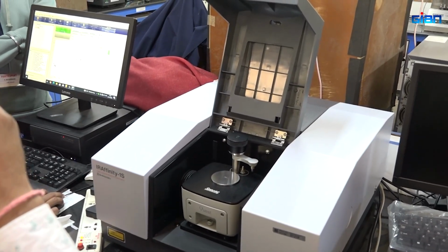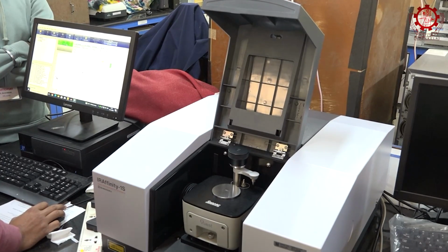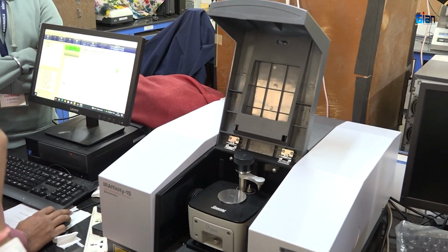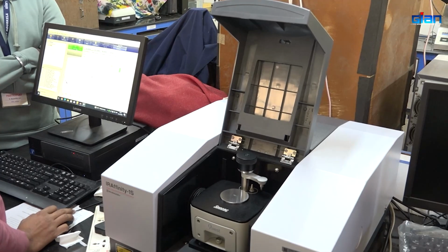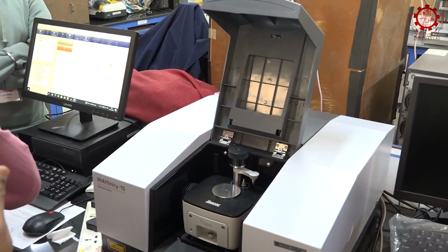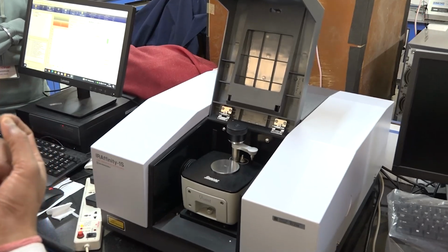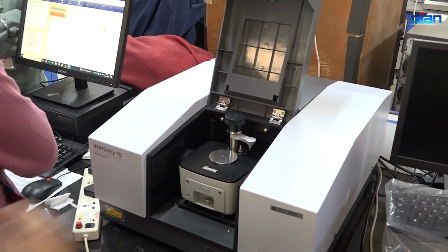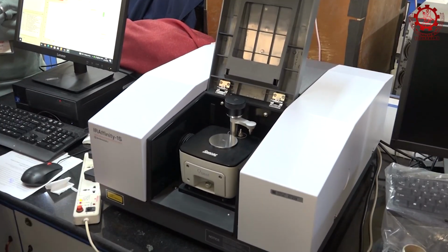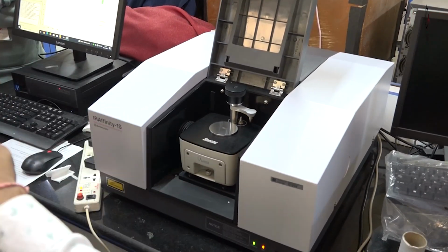Now when the solvent is evaporated, now we have a thin film. So that's why the concentration should be maintained properly, so that the thin film is not so thin that it will not absorb enough IR radiation. Okay. So it is sometimes fine, you can have 1 milligram of your sample. Okay. If you take that in maybe 100 microliter, that is enough, and you can put the sample here. And again, if you don't get a good spectrum, okay, we have already got the spectrum there. If you don't get a good spectrum, you can always put another drop. Okay.